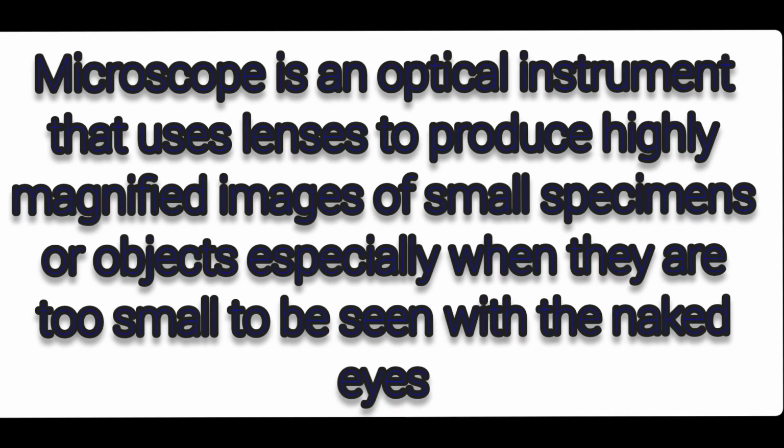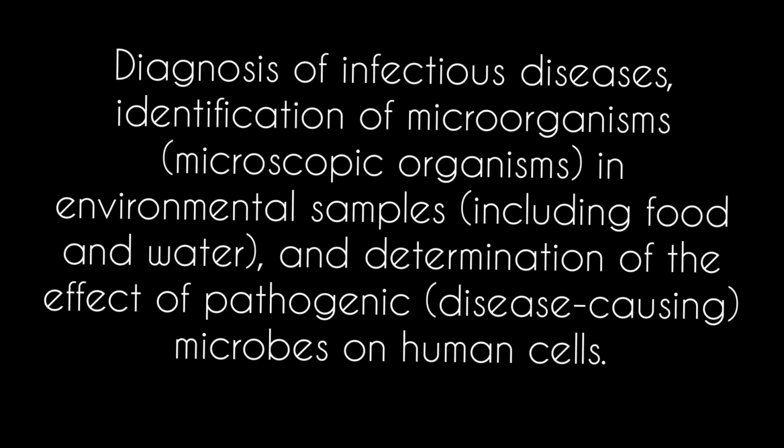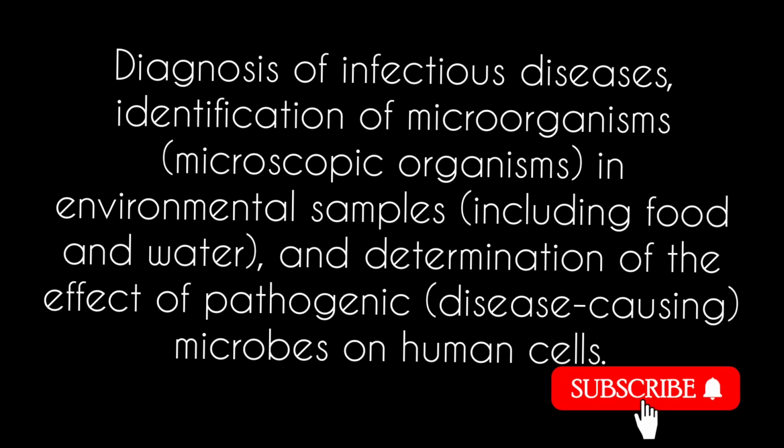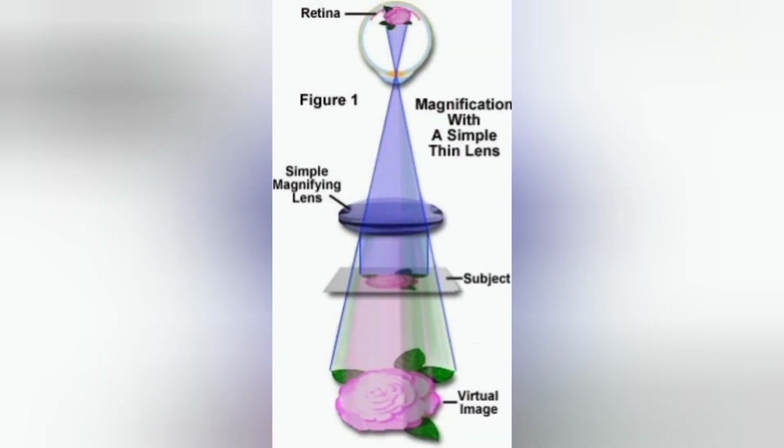It is an instrument that uses lenses to produce highly magnified images of small specimens or objects, especially when they are too small to be seen with the naked eyes. Scientists and healthcare professionals use it for many purposes, including diagnosis of infectious disease, identification of microorganisms in water and the environment, and determination of the effects of pathogenic microbes on human cells.